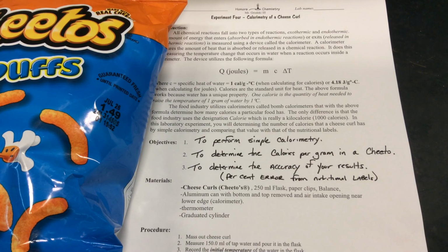So if you look at my objectives, we're going to perform simple calorimetry. Now I say simple because we're going to have some issues in this lab. Every single calorimetry lab has these issues: is all the heat going to go from the Cheeto to the water? And then the second objective is to determine the calories per gram.